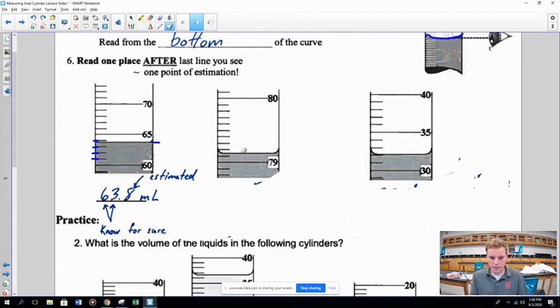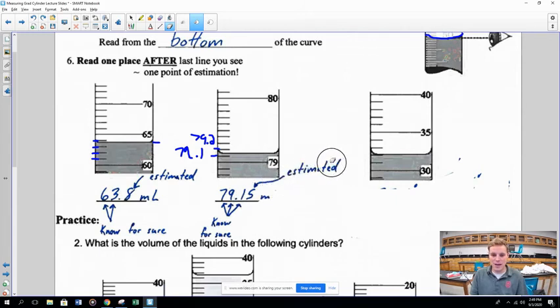On the next example, the reading falls between 79 and 80, and looking at the increments — 79.1, 79.2 — the meniscus is between them. So I know for sure it's 79.1 something. Is it 79.14 or 79.15? I'm estimating at that point — I said 79.15. The moment you have to estimate a number, that's when you stop measuring: estimate exactly once.